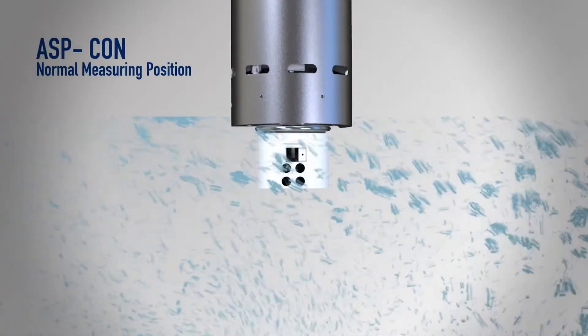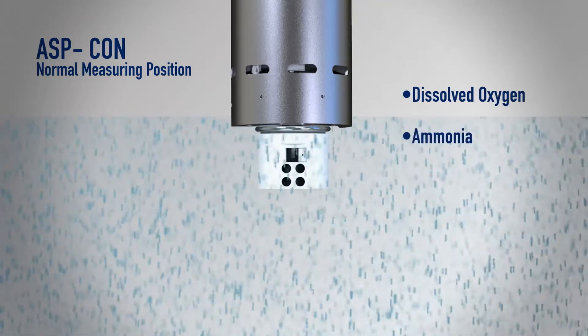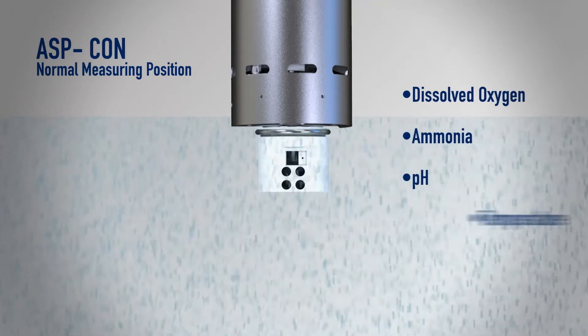Shown here in its normal monitoring position, the ASPCON measures dissolved oxygen, ammonia, pH and temperature.